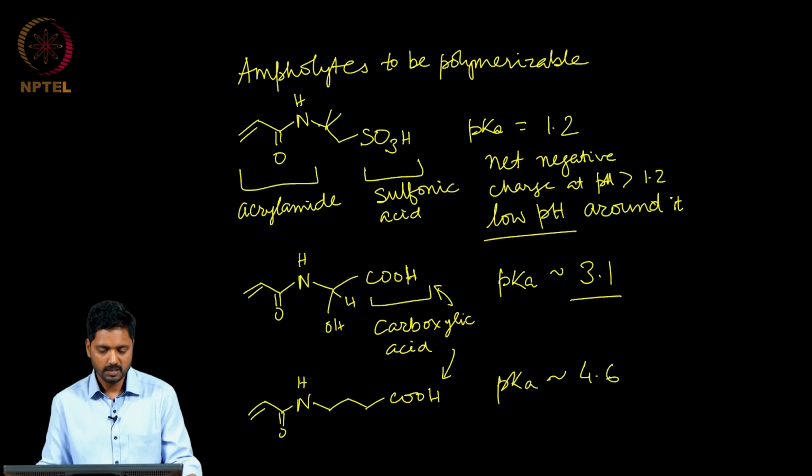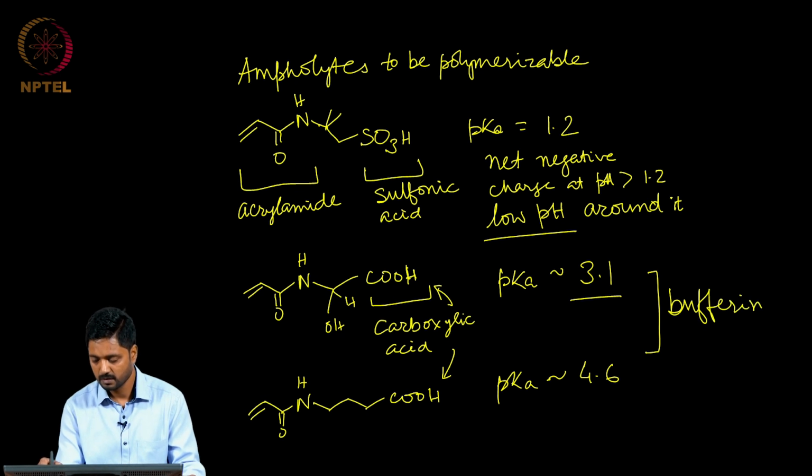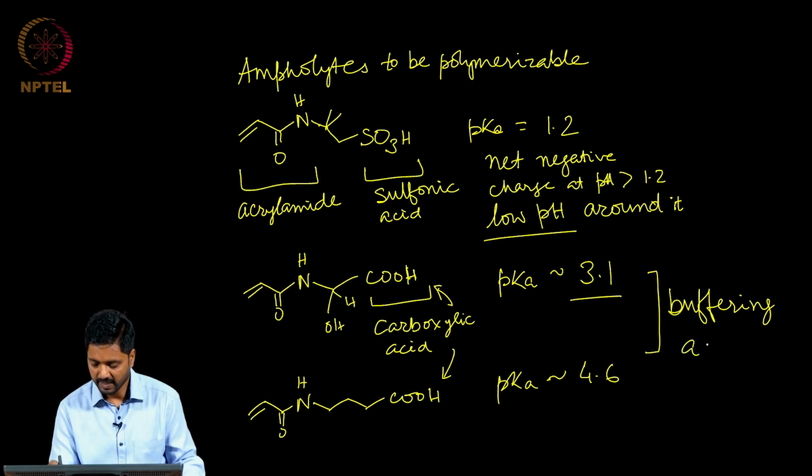Also note that these molecules are weak acids, so they will also create a buffering region around them, but these regions will still be acidic in nature.